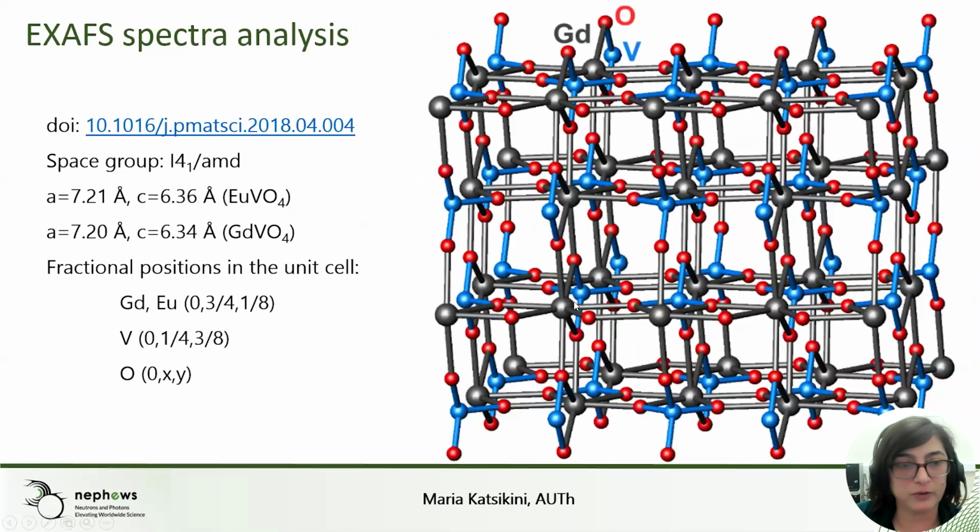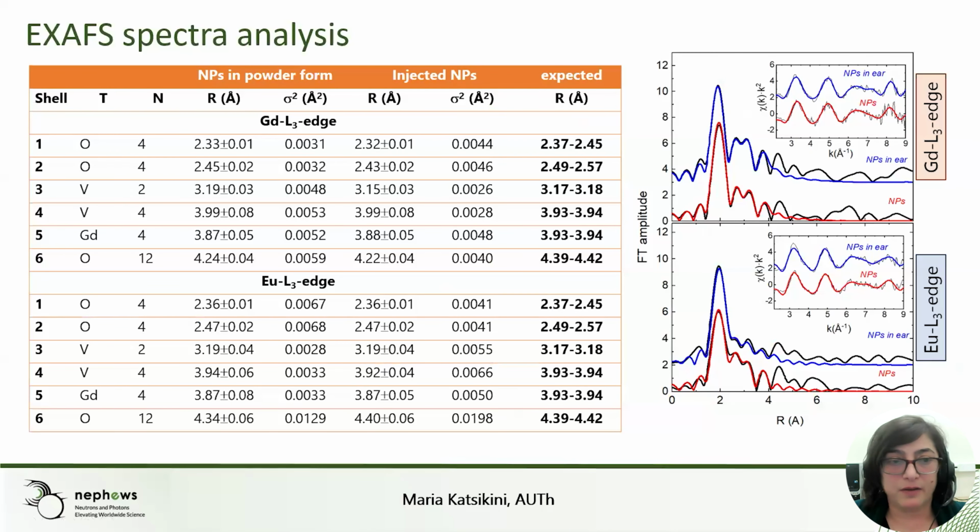They are not dissolved. Now, the fitting results of the EXAFS spectra for the gadolinium L3 edge and the europium L3 edge. Nanoparticles prior to injection and after the injection, we observe that the nanoparticles have the expected structure, and that europium substitutes for gadolinium.